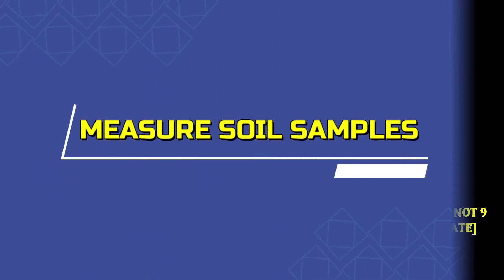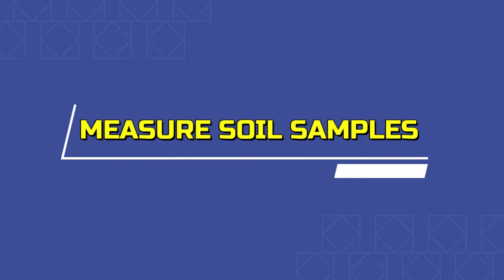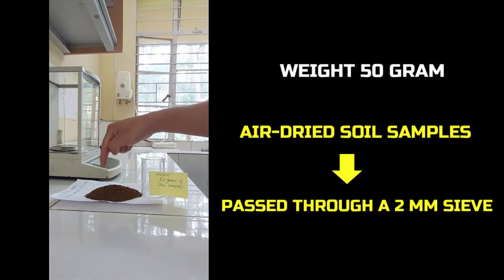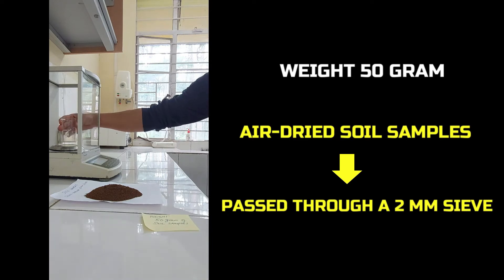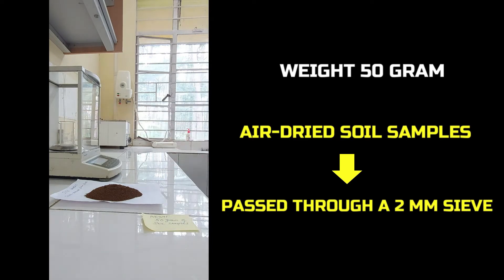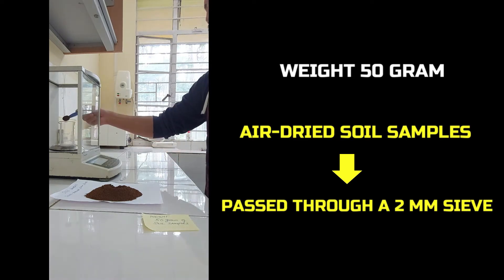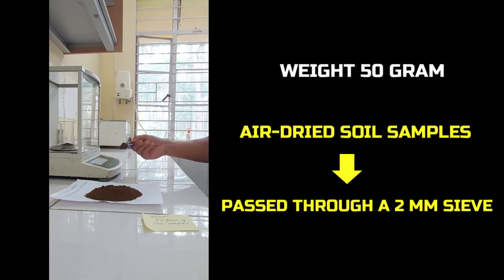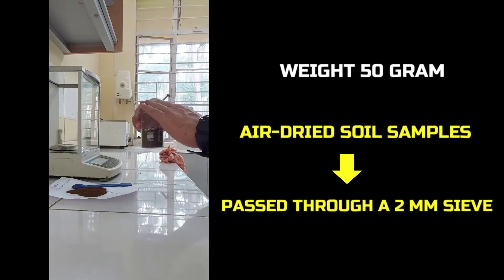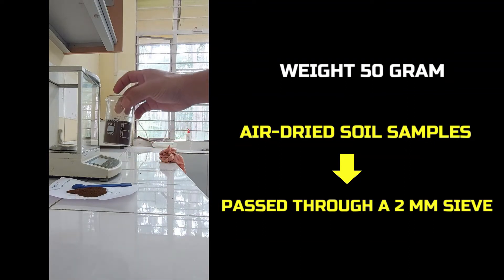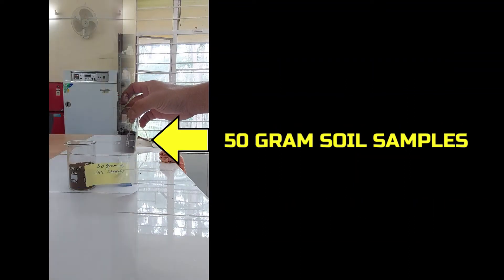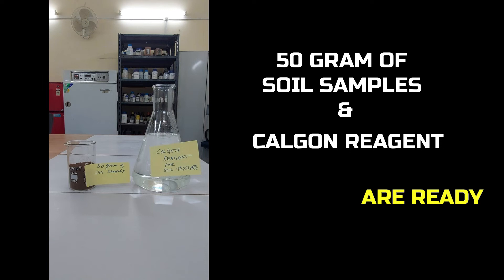Next is measurement of the soil samples. Weigh 50 grams of the air-dried soil sample which has been passed through a 2 mm sieve. This is the 50-gram soil sample. Now the 50 grams of soil sample and the Calgon reagent are ready.